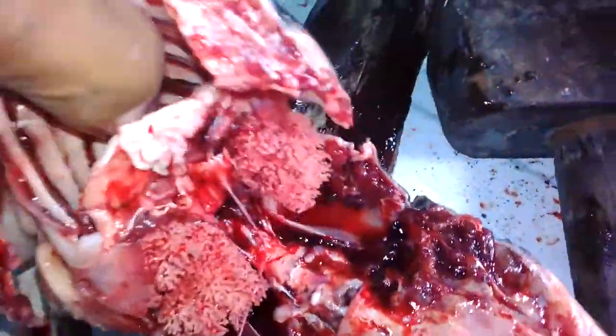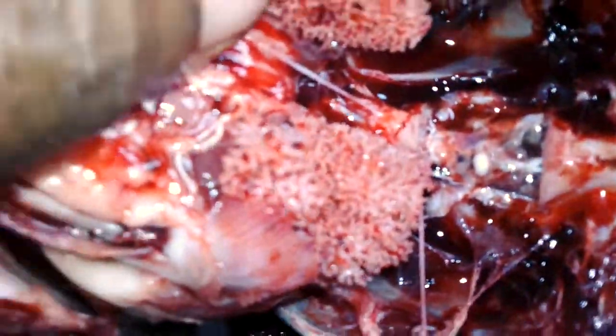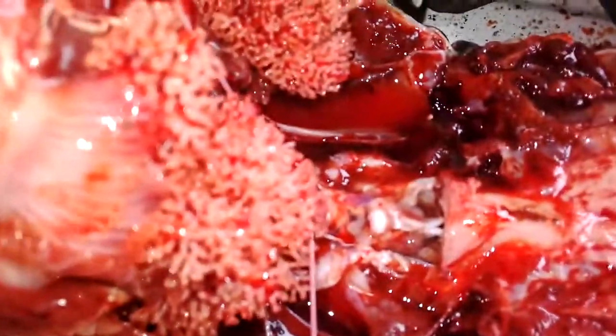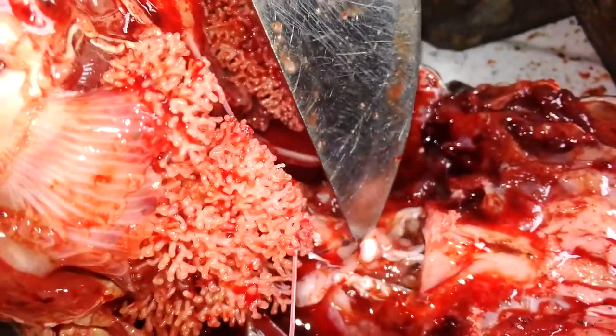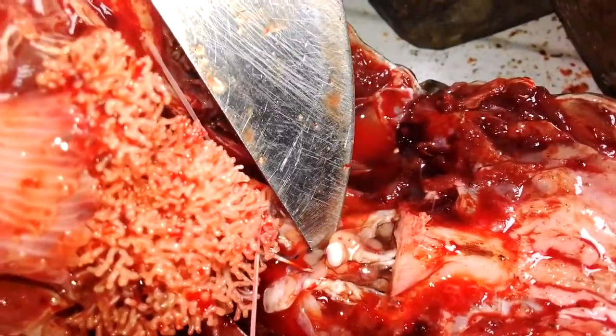The purpose of this video is to show you where the pituitary gland is. Exactly here — this is the pituitary gland. Where the knife is touching right now, the pituitary is sitting there.